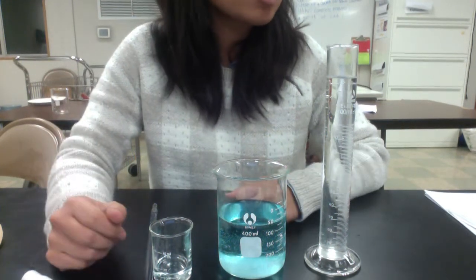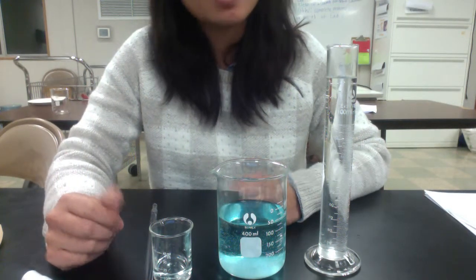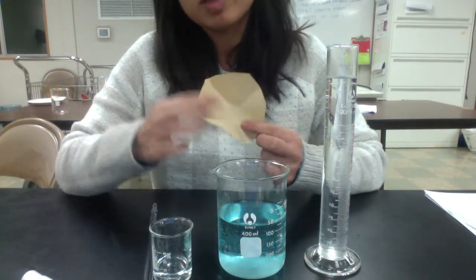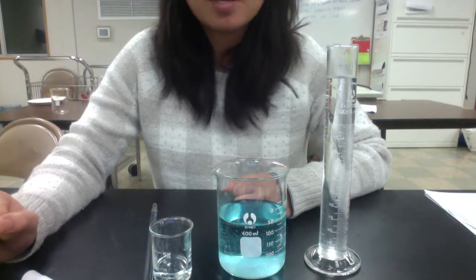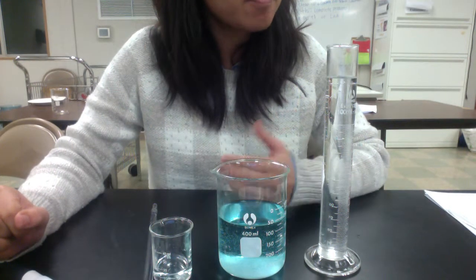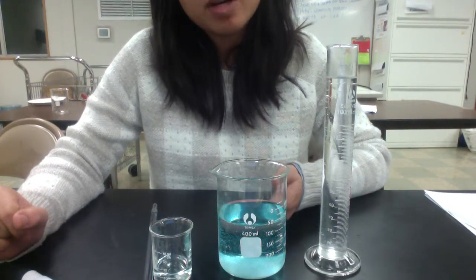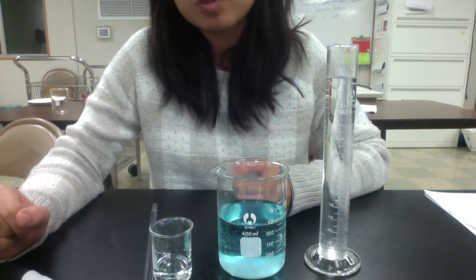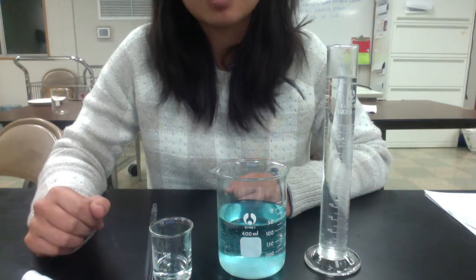Everything else goes back in the black bin except for your weigh paper. This is the only thing you should be tossing away. And that's it for the lab for part 1. It's going to be pretty much the same thing as for part 2. So if you do get to part 2, it's the same exact steps and procedures.